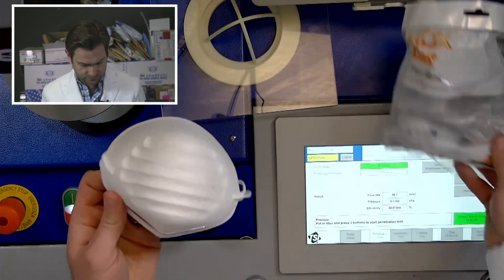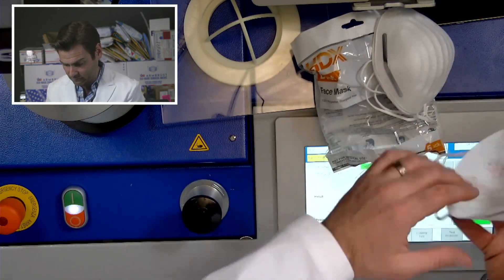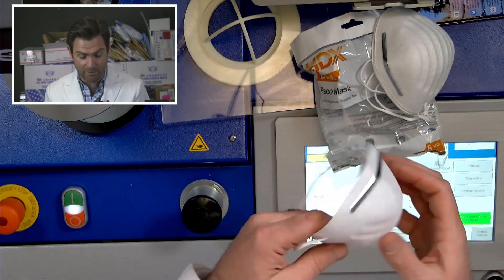I'll open this up. Oh, there's a bunch in there. That was surprising. There you go. Look at that thing — it is barely there.